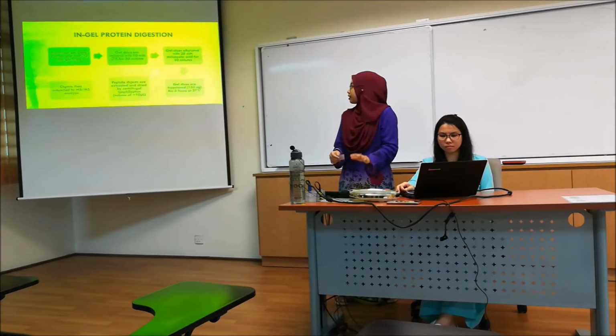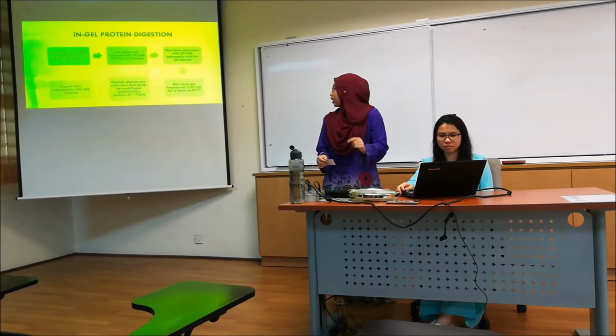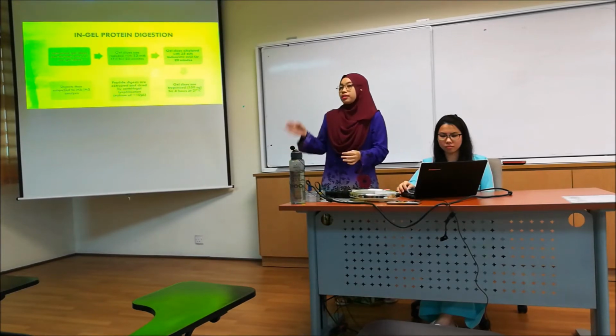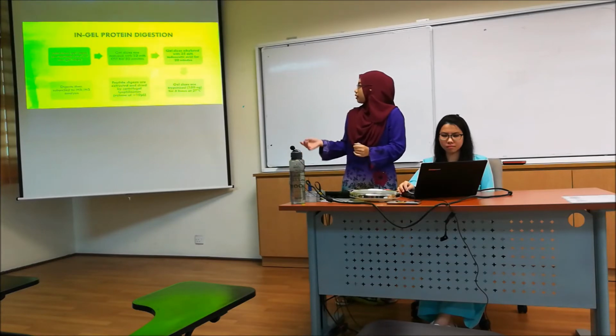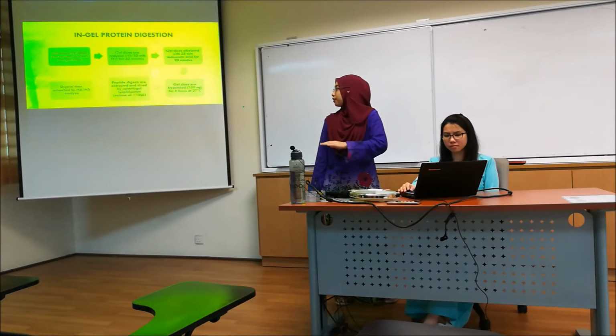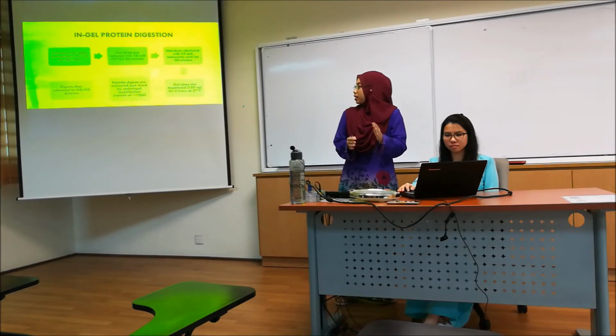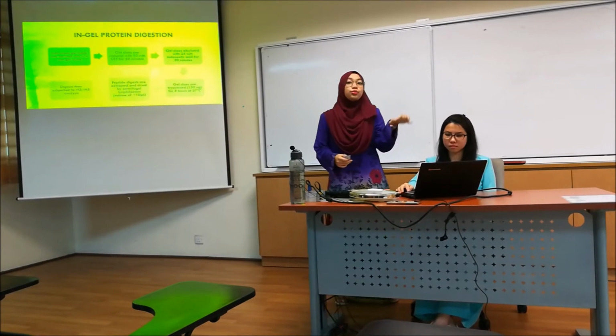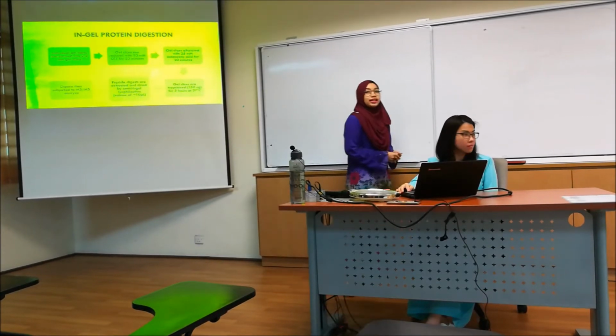Next, the gel slices are digested with trypsin for 5 hours at 37 degrees Celsius. Trypsin is an enzyme which cleaves the protein into peptides at the amino acids lysine or arginine. Those peptides are then extracted and dried by centrifugal lyophilization, and those digests are subjected to the next step, which is mass spectrometry analysis, which will be explained by my colleague, Roslina.